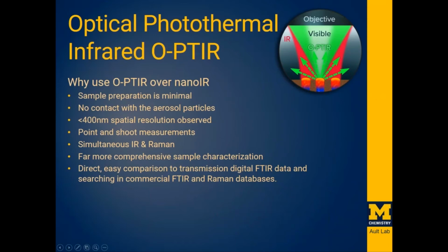We were able to use a silicon wafer or a quartz slide, a microscope slide, whichever we wanted to. That was very helpful. We worked a lot with somewhat sticky, gooey organic materials, and often this ended up being pretty challenging when we would try to do AFM with them because the tip would drag it all over the place and smear it.